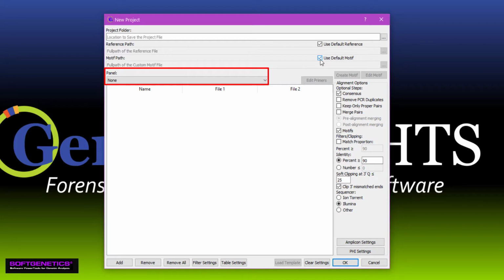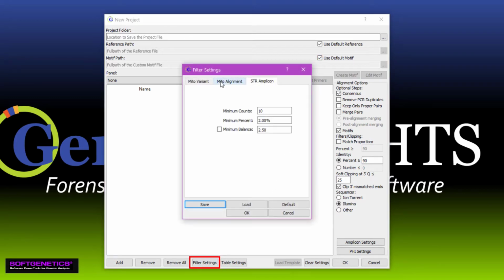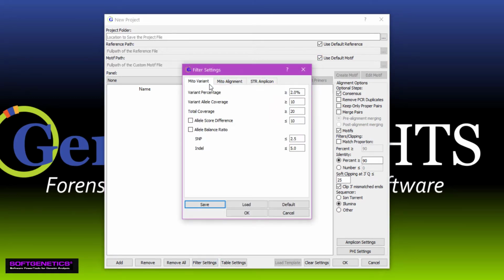The panel method for mitochondrial DNA analysis is the topic of a separate webinar, which we encourage you to watch. There are various alignment options and filter settings that you can customize, as well as the ability to mask personal health information.